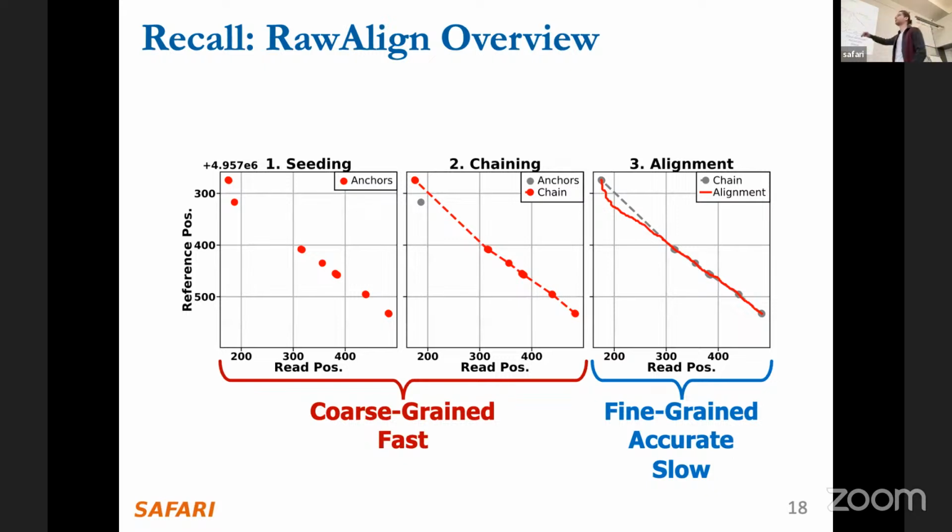Well, this is an excerpt, I guess. The array on the x-axis would go from 0 up to, well, it depends on your read length, right? It could be 10,000, it could be 50,000. The very longest reads, it's a stochastic process. The very longest we've ever seen is 2 million, I think.